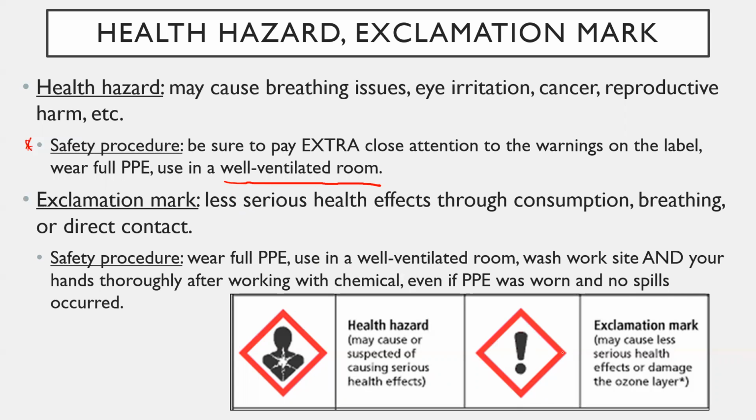The exclamation mark also means something similar to these last two. It's less serious health effects through consumption, breathing, or direct contact. So these ones won't really kill you, but it still might be worthwhile to be careful with it because it can cause some harm, right?